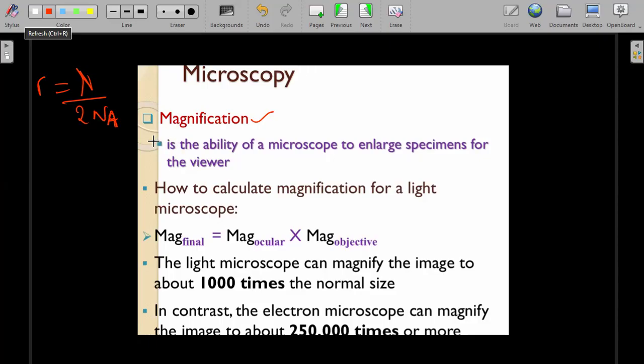Okay. So now we also have the formula for magnification. The formula for magnification will depend on the type of magnification you are carrying out. Let's say for a linear magnification. Linear magnification is given by this formula.